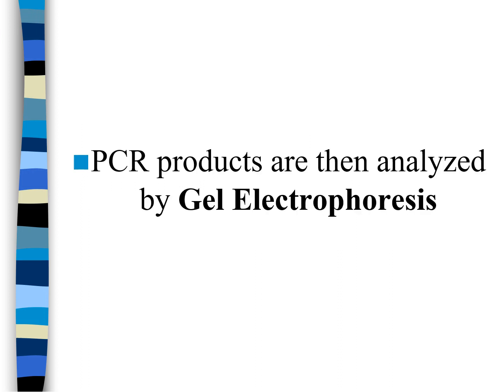Let's say we got the billions of copies of PCR product, the cancer gene we are looking for. Now we need to visualize it and we need to diagnose the patient. If they have this cancer gene for leukemia, that means they have leukemia. If they don't, that means good, they are healthy. So we need to perform gel electrophoresis.